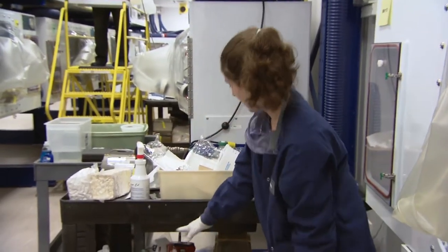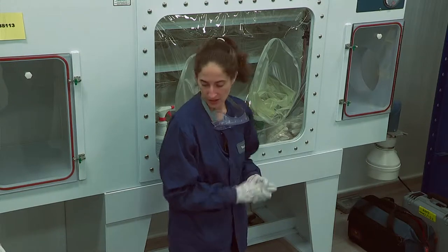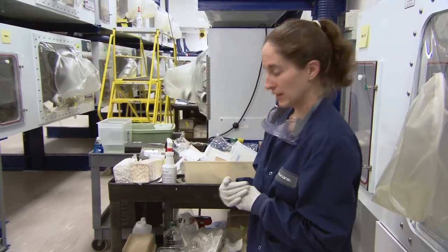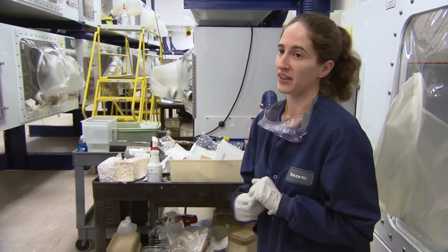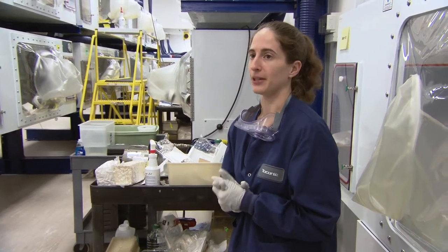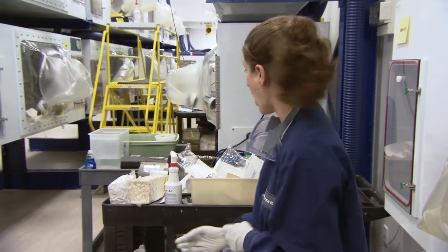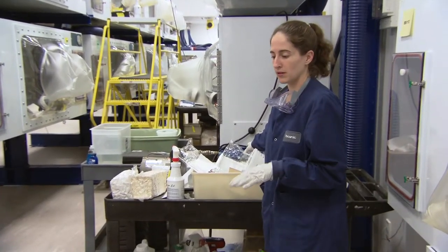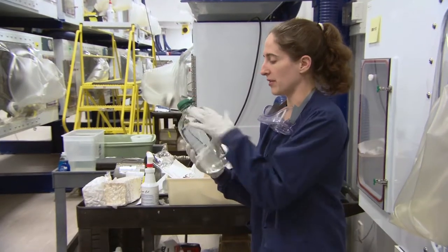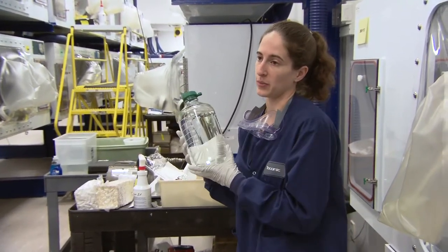We went to the nest pack bedding and the Hydropack just for efficiency — it's a pre-measured amount of bedding, every cage is getting the same amount, you just drop it in, and they have some nesting material as well. I presume you're testing the quality of the water coming in those packages? By batch, yes — that it's actually sterile. So the Hydropack machine, like all our equipment, is validated about once a year, and then there's periodic batch testing. We have a Hydropack machine here. Do you do validation methods for your water in the flasks? We validate our autoclaves once a year — we have a cycle time specific for a water run. We use the autoclave tape, and in some areas, in every load they'll have a sacrificial bottle with a spore strip in it, test it, and won't release anything from that load until the batch has been cleared in the QC lab.